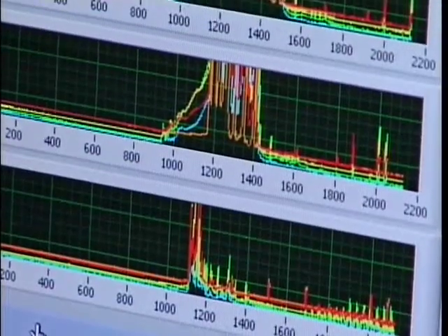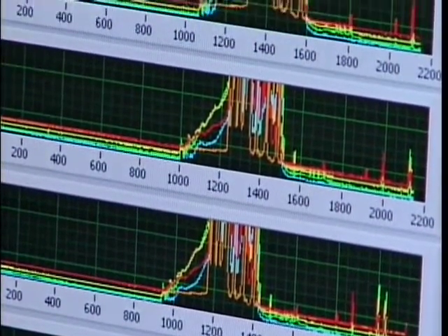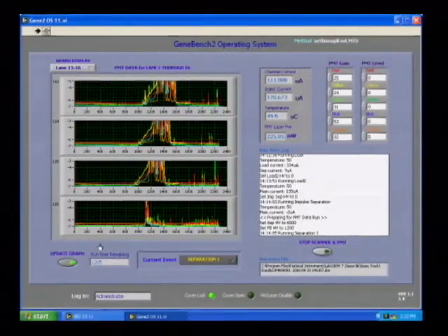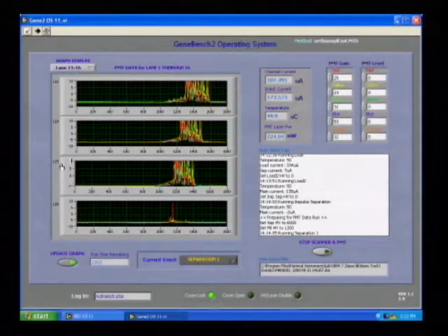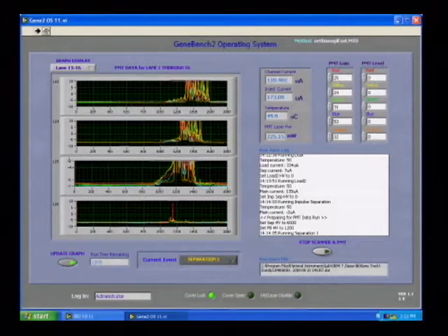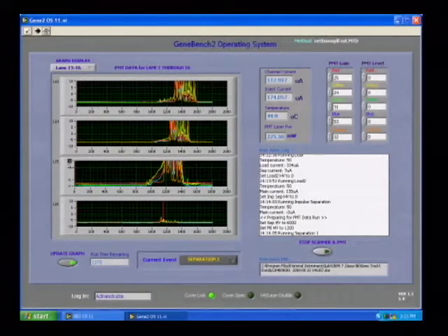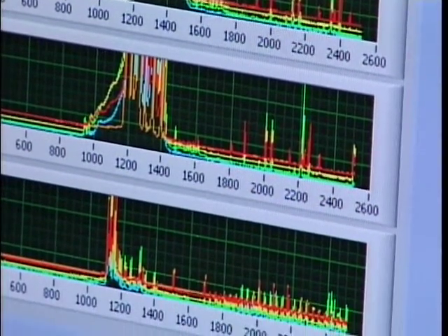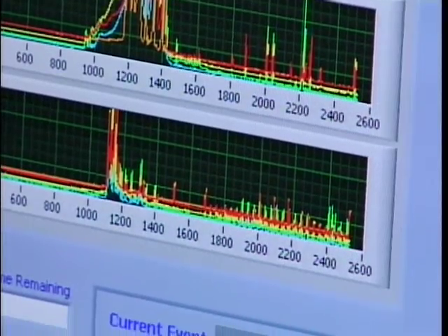From the plot, you can see size standards appearing following the primers, with alleles also starting to appear. The run will continue in this fashion until all alleles have appeared. With the FAST protocol, this run will take 15 minutes to achieve 500 bases of separation, and the run continues under full computer control.